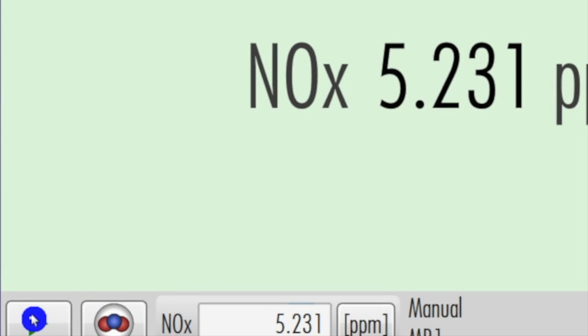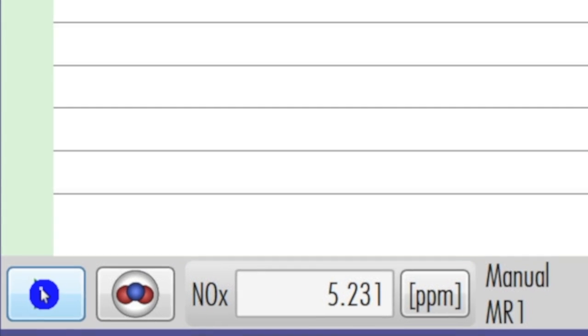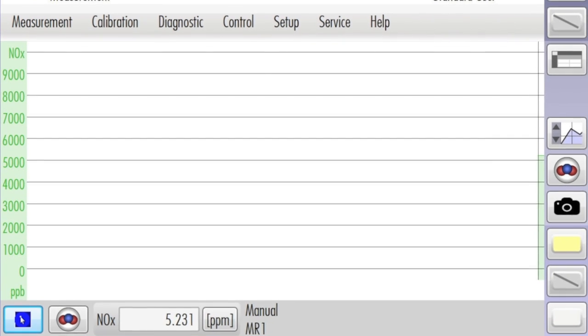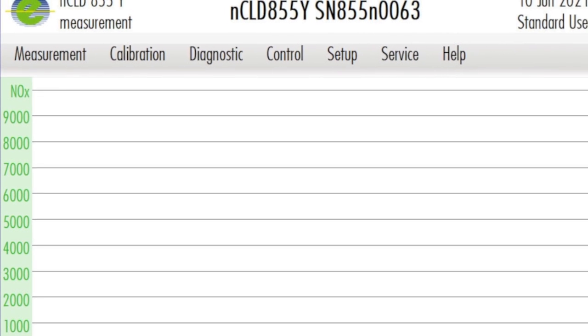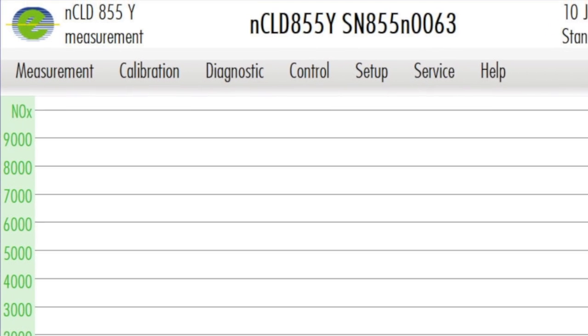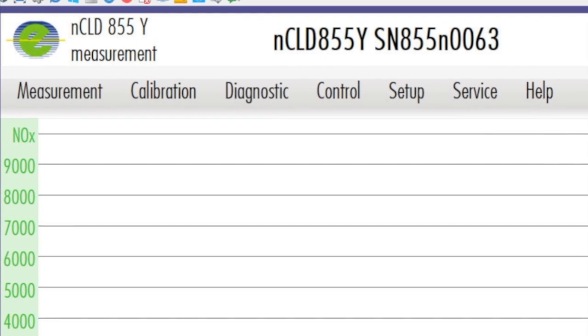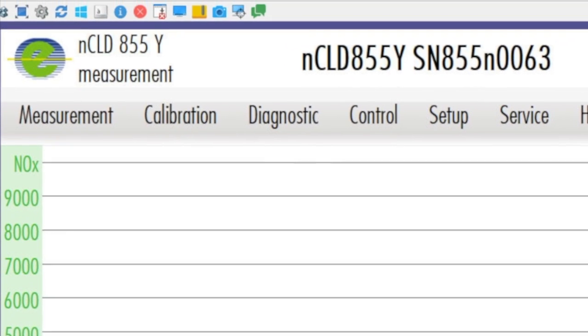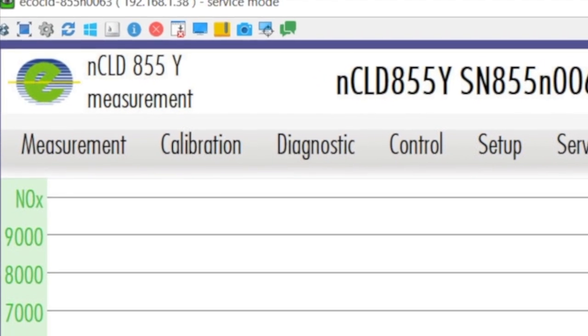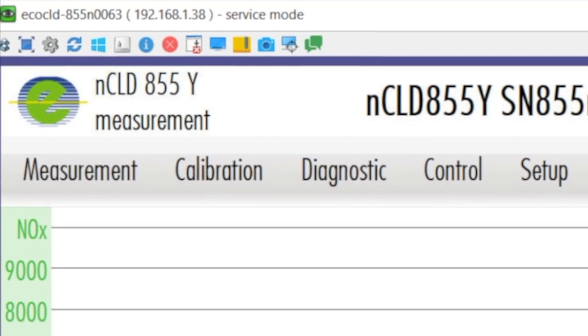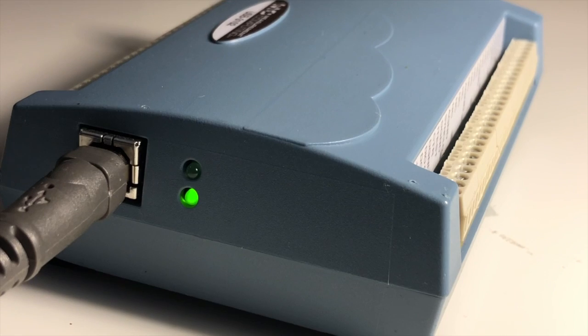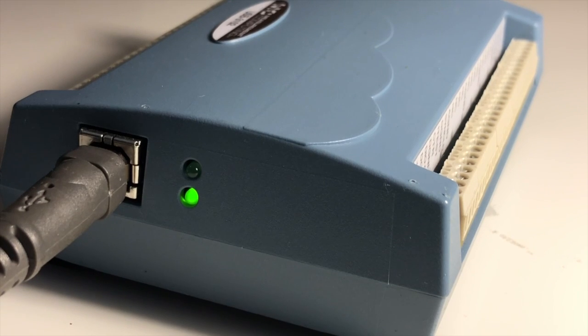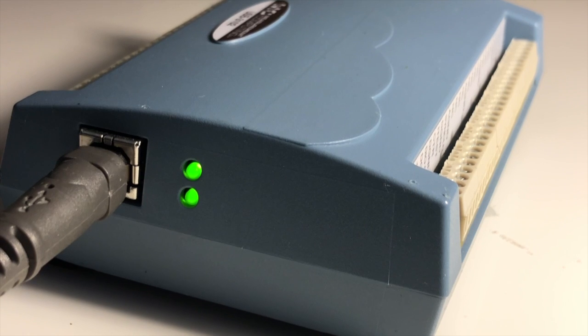For the analyzer to send out data it needs to be in measurement or ready mode. If your setup is correct when you switch to measurement mode a 4 to 20mA signal is sent out to the USB 3102 box. The confirmation of the signal output is the changing of the status indicator light to solid green.